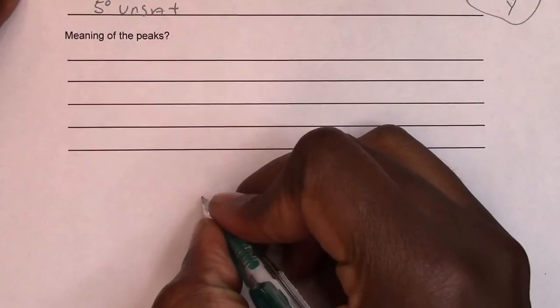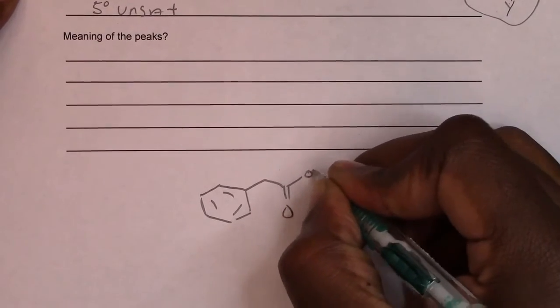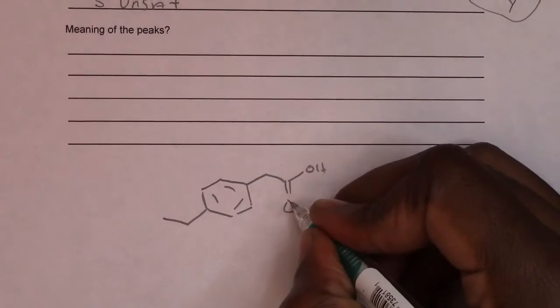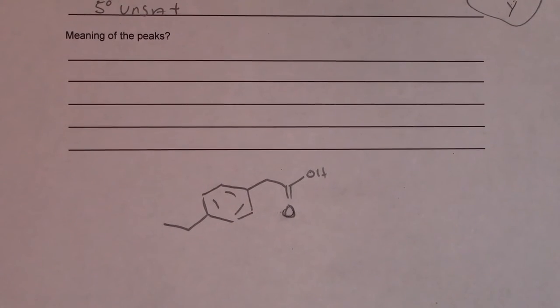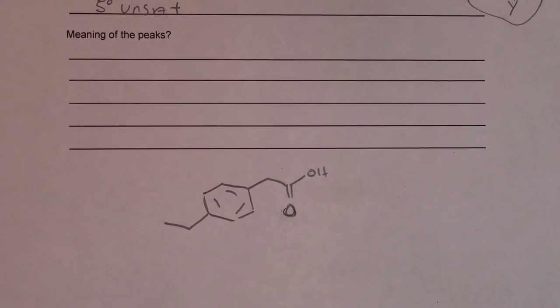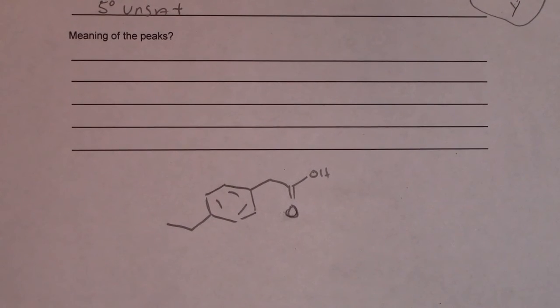So once you guys have had a chance to go through this, hopefully everybody has gotten this as your structure. And you can see that this corresponds to all of the peaks that we see in the proton NMR. Now I will put the key up, actually before I leave tonight, I'm going to post this video as well as put the key up to the other problems, but be very careful about looking at the key. Again, looking at the key will automatically allow you to see exactly why your structure is wrong.